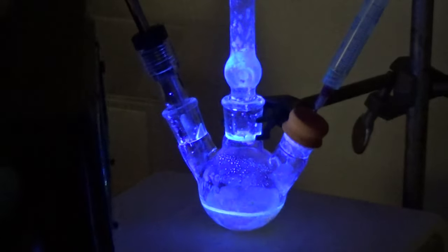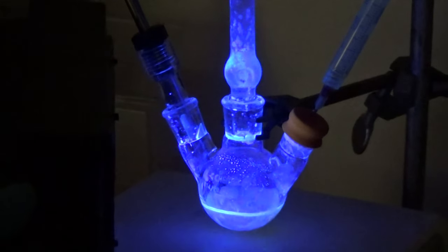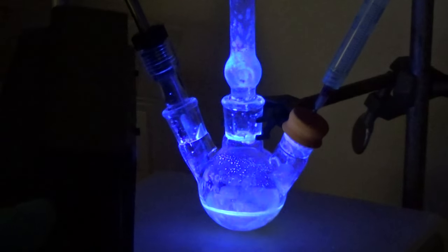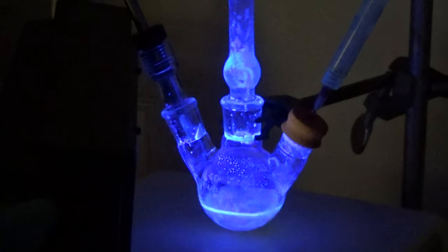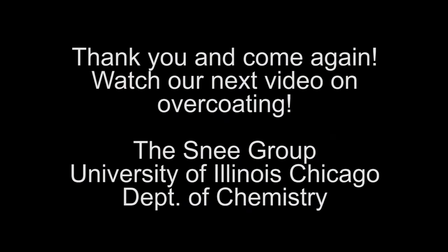Now these are pretty good cores. This is the only method I am aware of to make cadmium sulfide. Again, I use a little zinc. It's the only method I know to make cadmium sulfide without deep trap. It's not perfect. You can see that the sample is a little purple. To make it nice and bright for bioimaging, what we like to do is then do a zinc sulfide shelling, which we'll show next. All right, I hope you like this tutorial, and I hope you make a lot of good quantum dots.